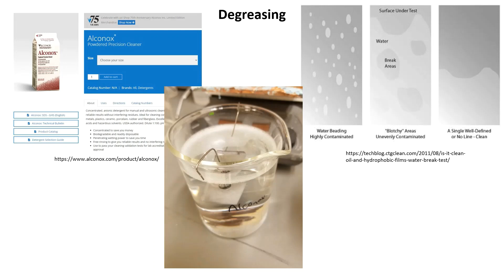So the first step in this is degreasing the part. Any oils from my hand could ruin the anodizing and surface finish. So first I solvent washed it with acetone, then isopropanol, and then let it dry.